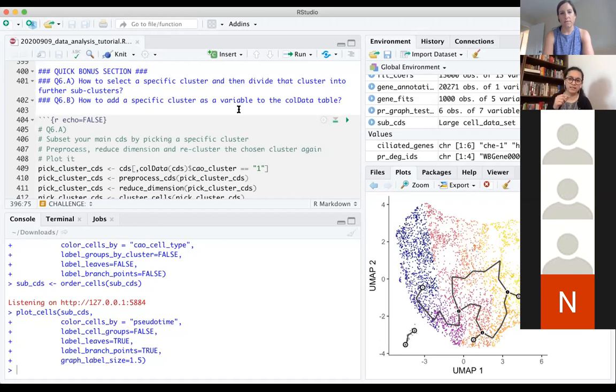But if you set the seed to a particular value, then it's going to be reproducible every time you do the analysis. You can literally Google set seed, and it'll give you all the information that you need. It's super simple. It's just one line that you add and run when you do the analysis, and it'll help you not have varying results, and you don't have to panic. Great.